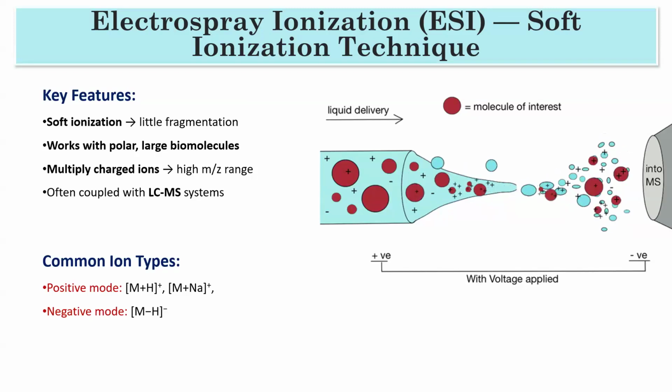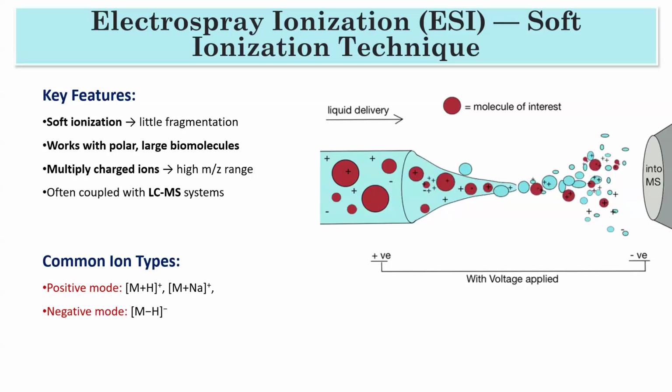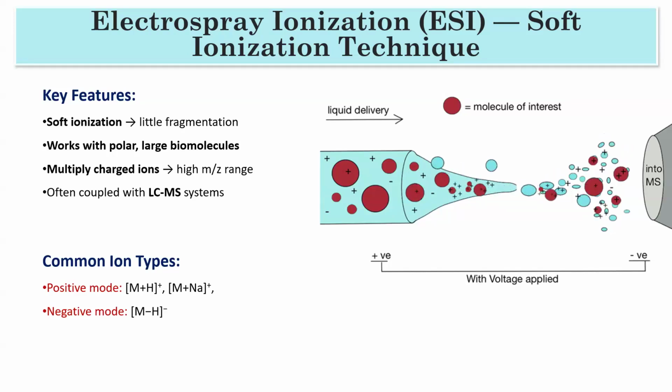Santosh is asking whether there is any special criteria while selecting the solvent, like avoiding salt. Actually, salt is not good for the ESI method. You should find a solvent, and mostly people use polar solvent.